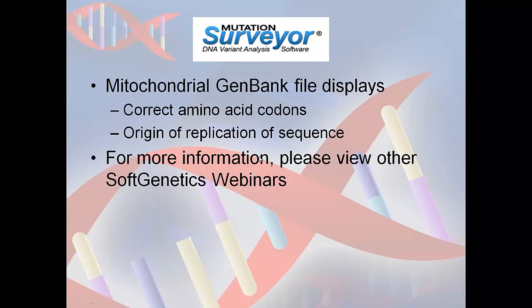This has been a brief webinar on analyzing mitochondrial sequence data using Mutation Surveyor software. When you are done analyzing your files and the variants have been confirmed, you may use any of the reporting options available in the software. By loading a mitochondrial GenBank file, Mutation Surveyor will display important annotation information such as the correct amino acid codons as well as the origin of replication of the sequence. If you are interested in learning more about other features in Mutation Surveyor, please view our other webinars.